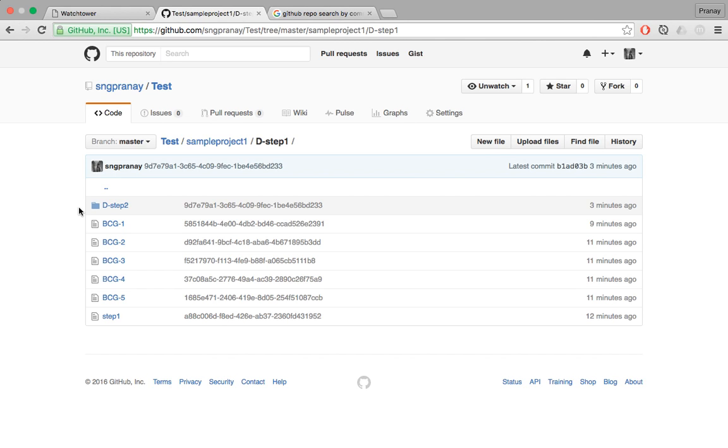As you notice, when the experiment grows really big and hairy and long, with a bunch of directories inside each other, this actually solves a very big problem. It tracks each and every test tube that is important to you. It tells you where it came from, and it tells you what happened after it. So I solved the main problem that I set out to solve, which was somehow making a glue between tracking and observing information.